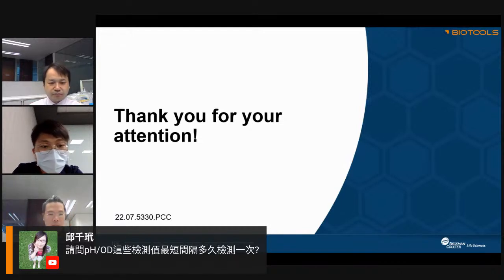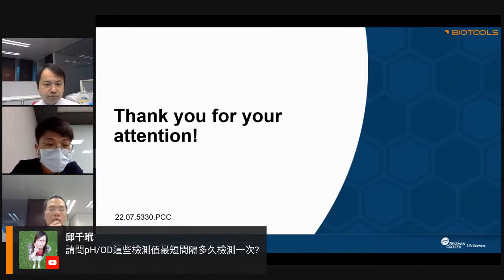Okay, right. So the minimum cycle is around 3 minutes, 3 minutes for each reading. So for example, if you want to measure biomass and also pH and DO, the fastest speed is 3 times 3, which is 9 minutes.